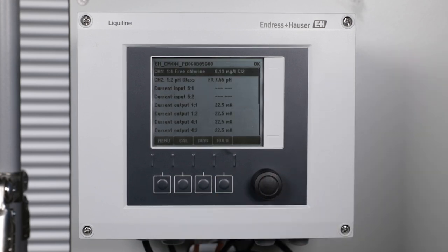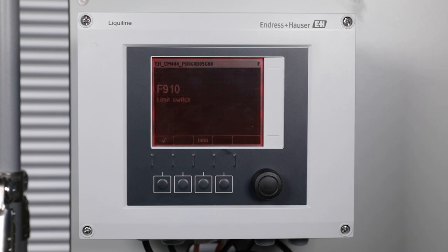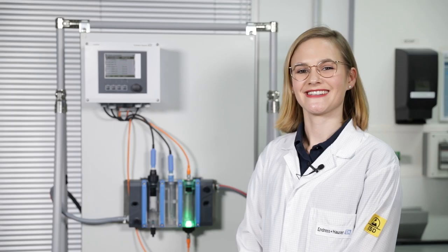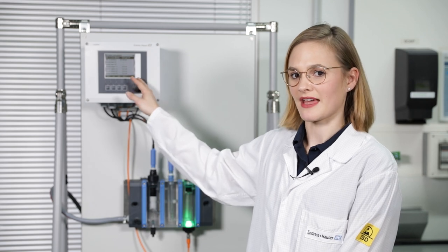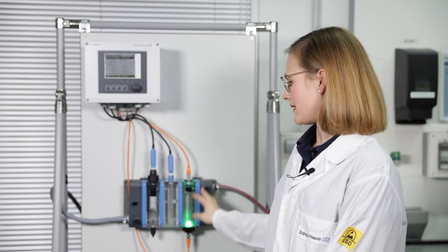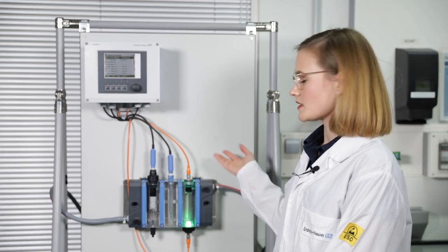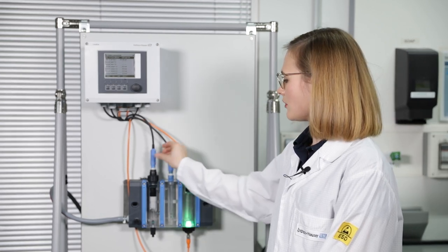As soon as the flow rate is insufficient, F910 limit switches is displayed on the device along with the red screen and the red status indication light on the assembly. So any other error that is detected by the transmitter and results in a red screen is also displayed on the assembly, so not only due to the flow, but also to the sensor connection for example.